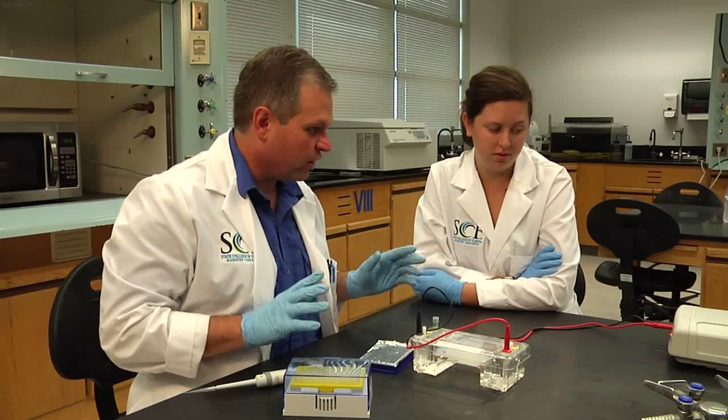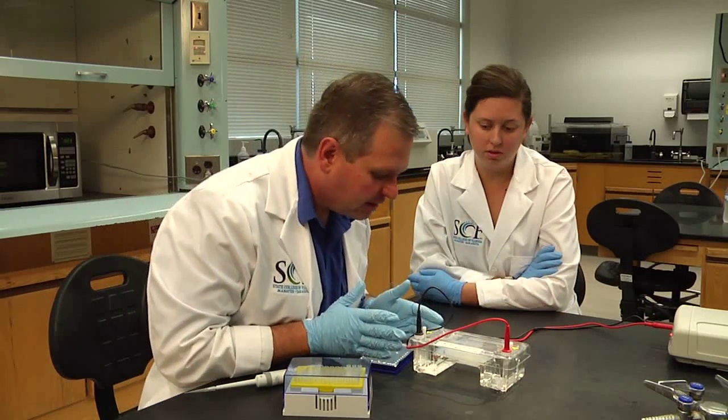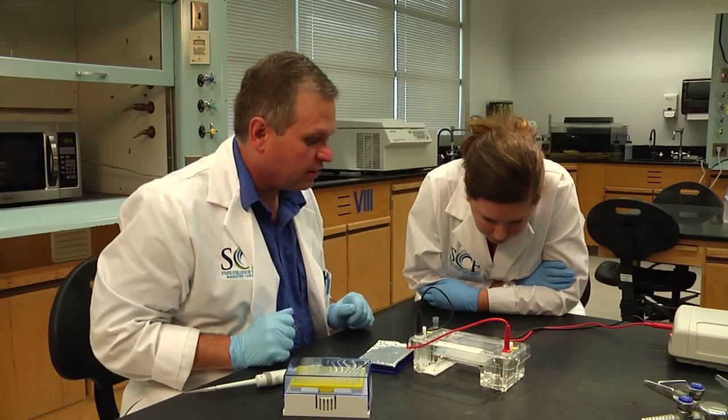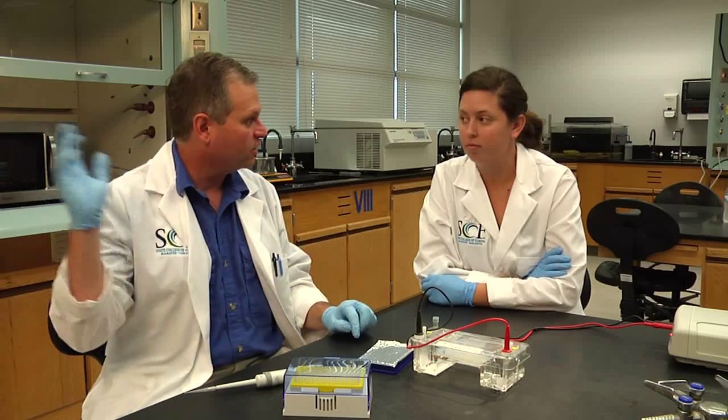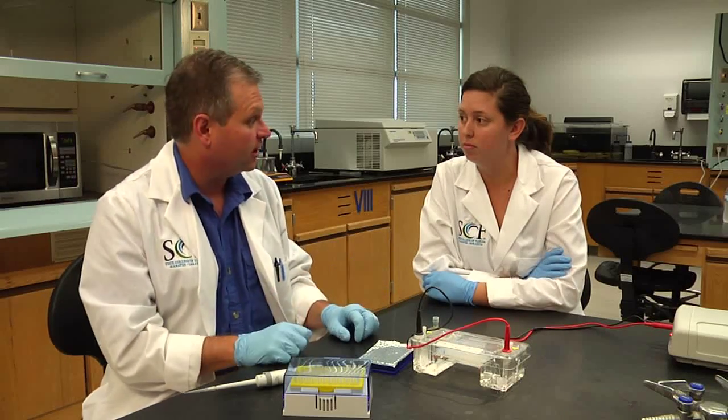And the thing to check before you walk away is: do we see bubbles coming up? There are some bubbles coming up — it's all running just great. So let's give this about 20 minutes or so, and we'll come back and I'll show you how to document it with the gel imaging system.